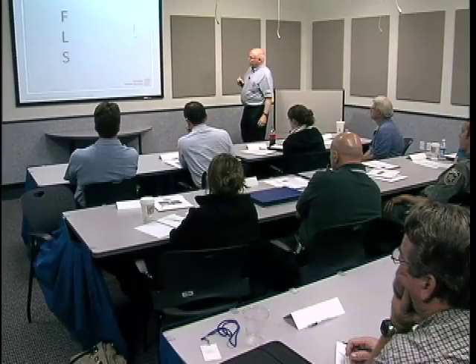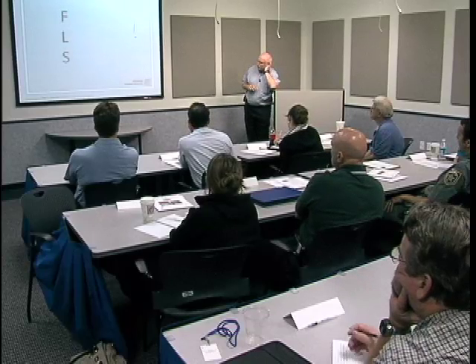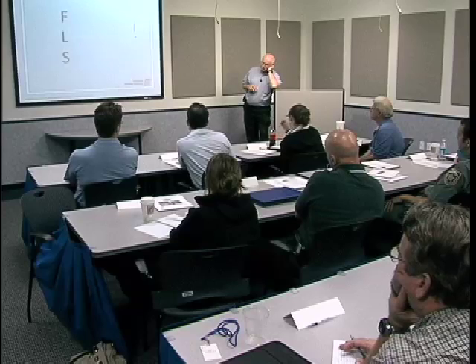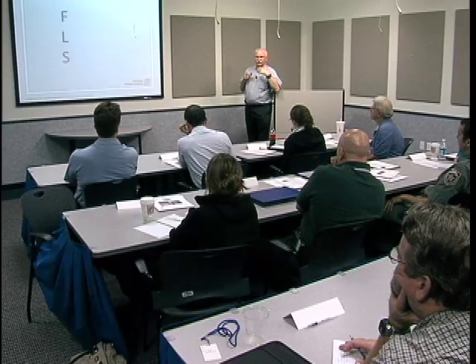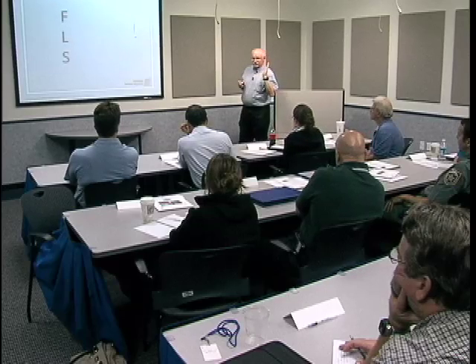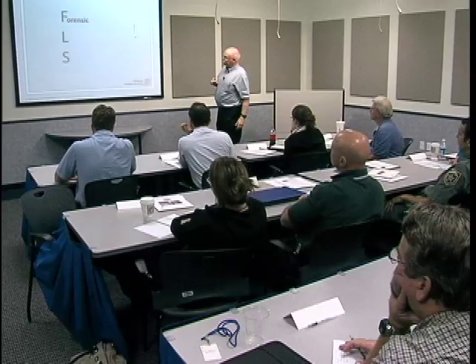One of my colleagues in Canada, a lady named Della Wilkinson, had this idea long before I did, and she felt that it was much more appropriate to refer to them as forensic light sources, and that way the sort of the mind thing about alternative would be kind of left out of it.